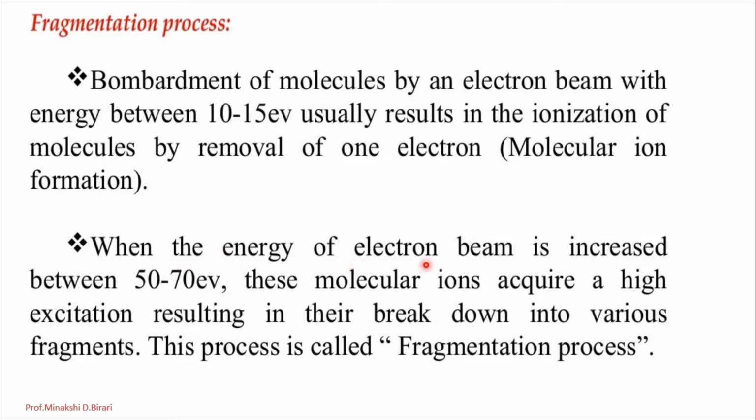When the energy of the electron beam is increased to between 50 to 70 electron volt, these molecular ions acquire a high excitation, resulting in their breakdown into various fragments. This process is called the fragmentation process.